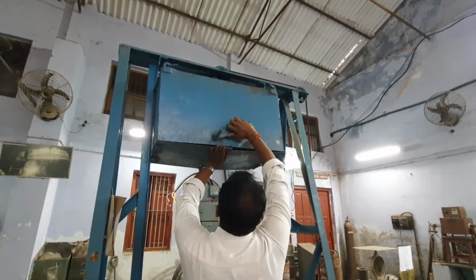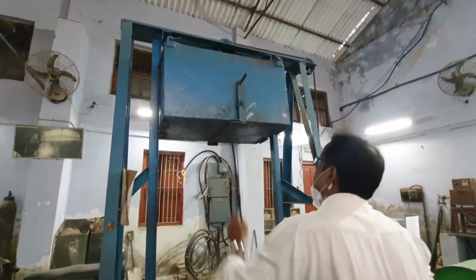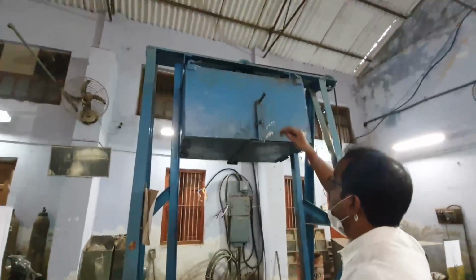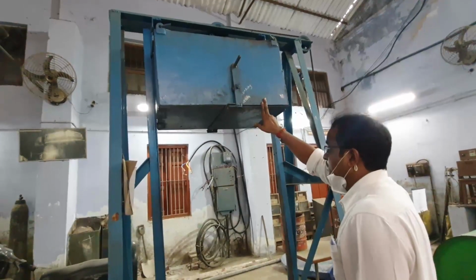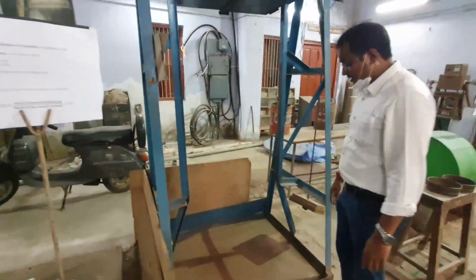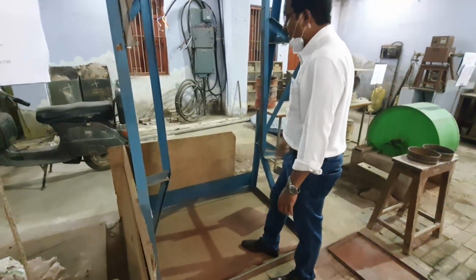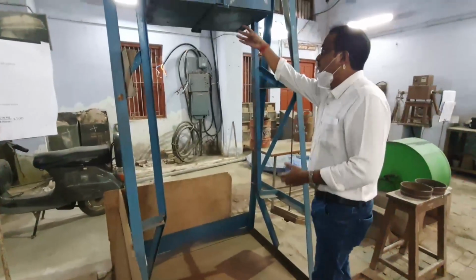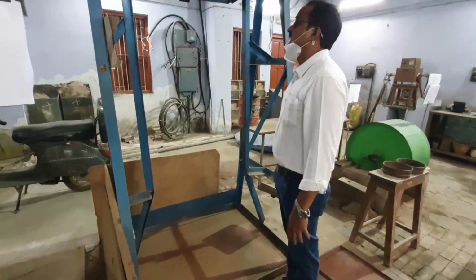How will it be locked? It will be locked by this latch. Locking this latch, now it is closed. Once it is closed, we take the 5 kg material, suppose iron ore, and keep it in this box. After that we open this door. Then from this 2 meter height, at the bottom there is a thick steel base plate, and the material falls onto it. We are subjecting the material to impact. In free fall, it is subjected to impact force, and in that impact it will break into pieces.